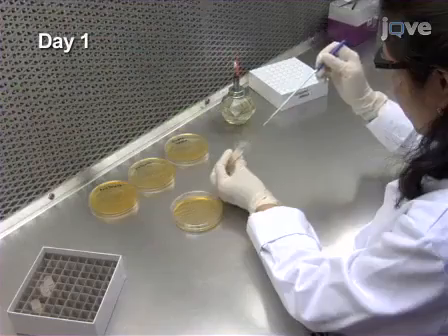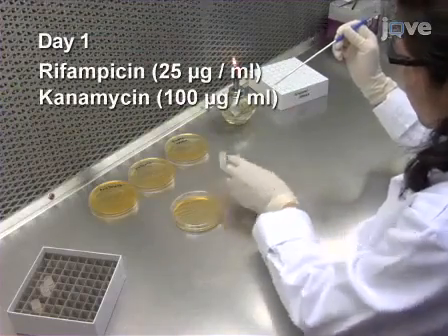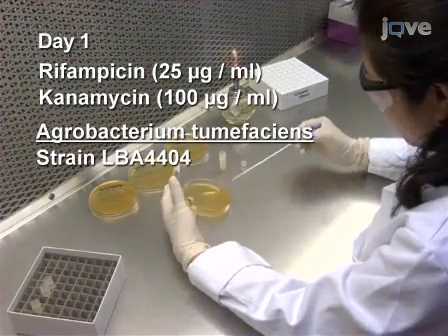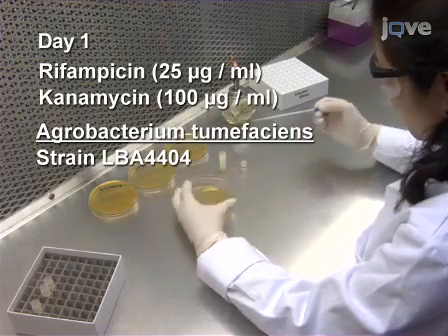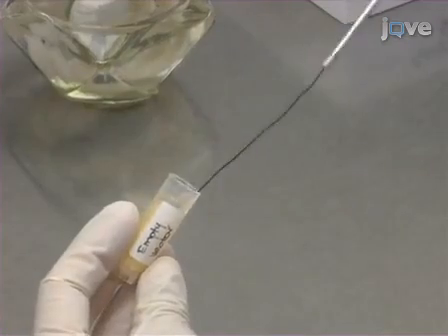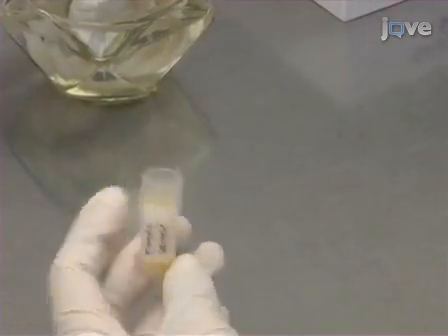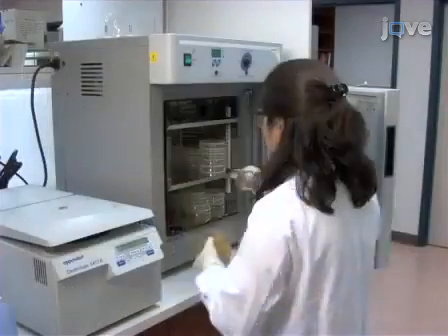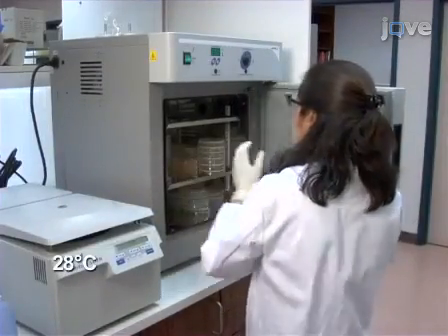On day 1, streak agroplates with glycerol stocks of Agrobacterium tumefaciens containing the vectors for the cell death assay and the vector with the GUS expression cassette. Always include an empty vector as a negative control or stuffer when multiple culture combinations are being tested. Incubate the plates at 28 degrees Celsius for 2 days.